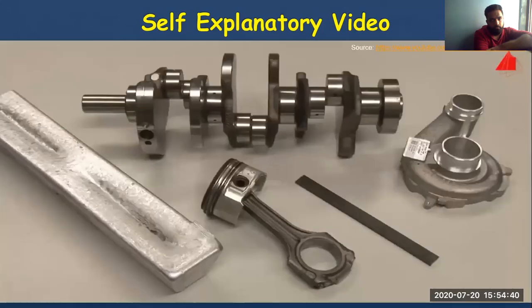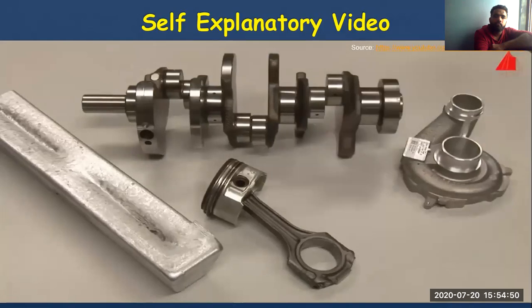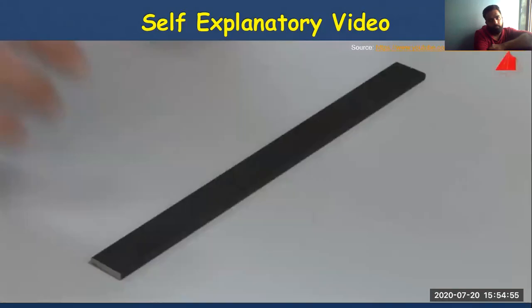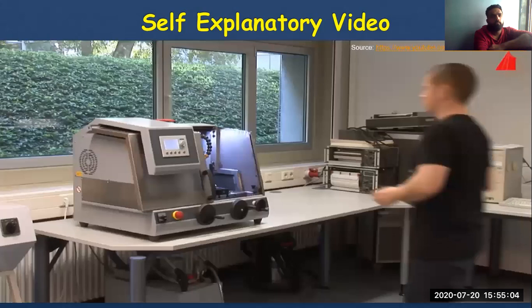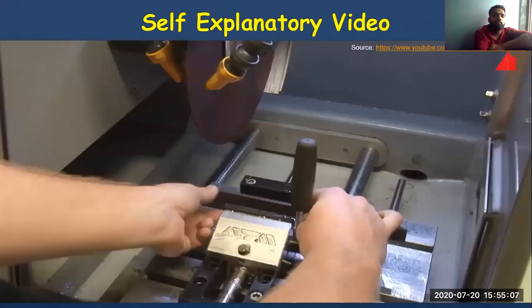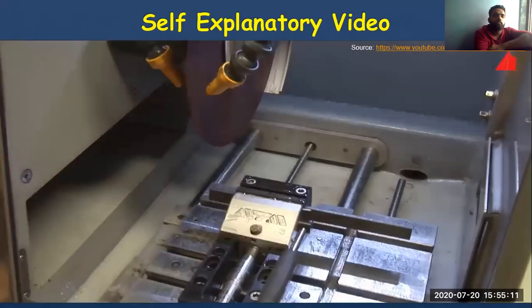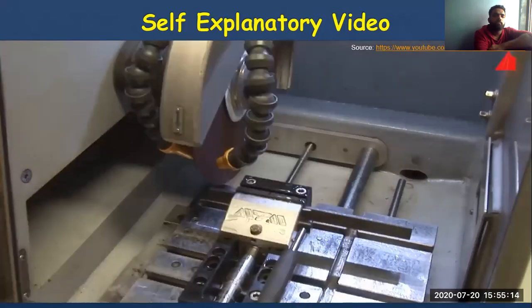As a typical example, we are going to investigate a bar made from a steel used millions of times, the plain carbon steel C45E, with 0.45% of carbon. To start with, one of our material testers defines the intended sectional plane and marks it on the bar. In this case, it's a longitudinal section. Then he takes the bar to the abrasive saw to cut out a small sample. He fixes the bar securely, prepares the machine, selects the cutting parameters, and starts the first abrasive cut.